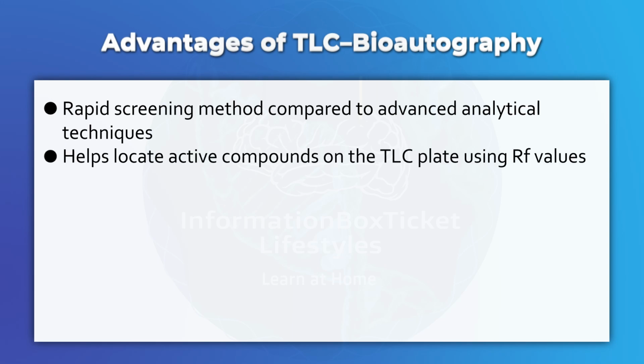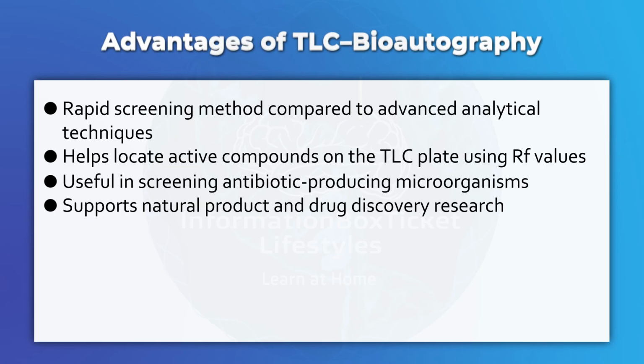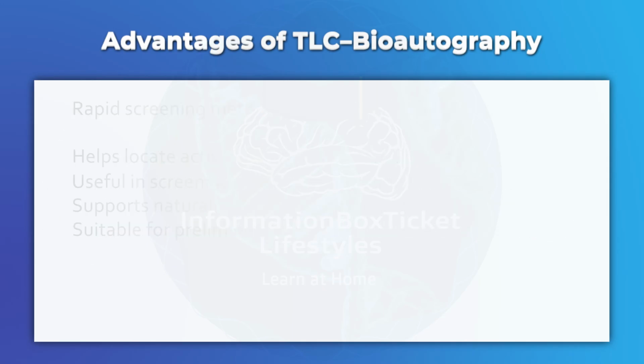Helps locate active compounds on the TLC plate using RF values. Useful in screening antibiotic-producing microorganisms. Supports natural product and drug discovery research. Suitable for preliminary analysis before HPLC or spectroscopic studies.